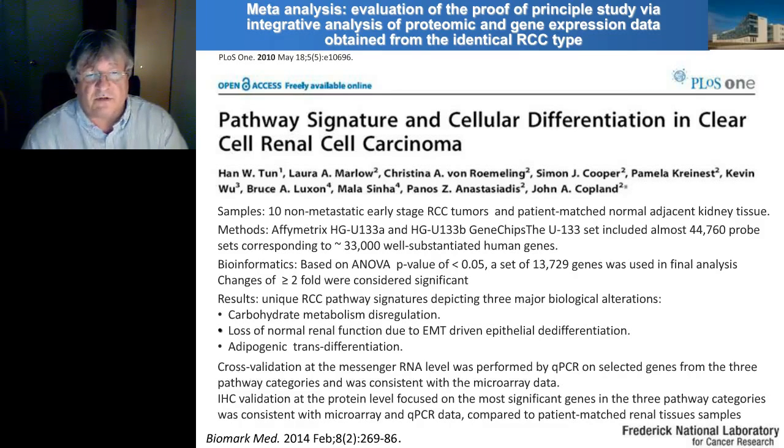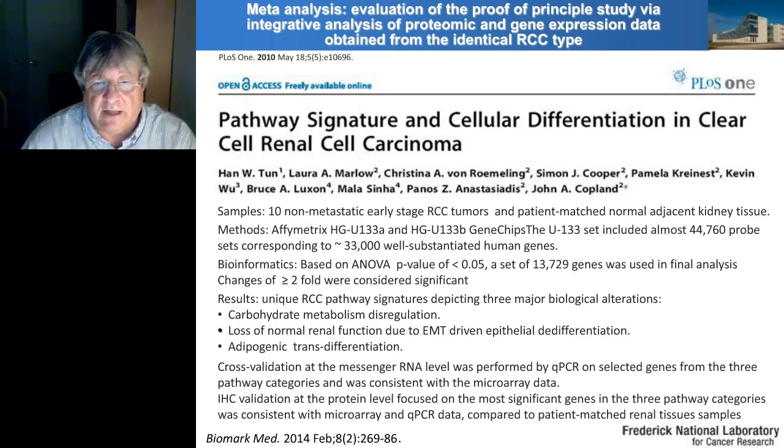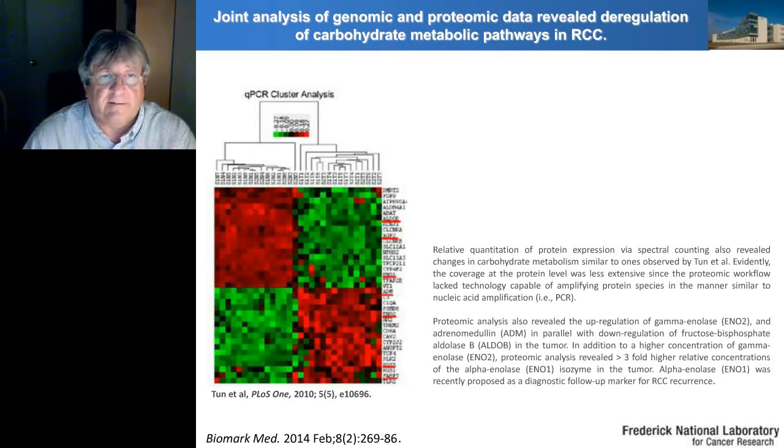So this group did cross-validation themselves. They used qPCR and immunohistochemistry to confirm the initial findings. So we wanted to see how that looks in comparison to our data.